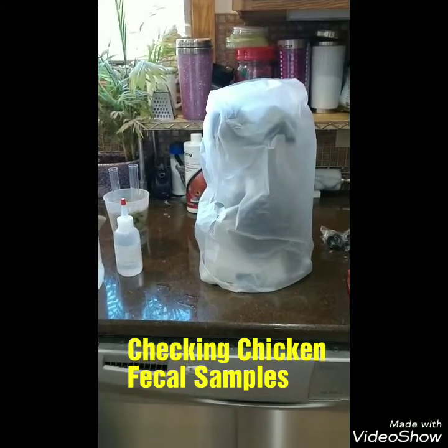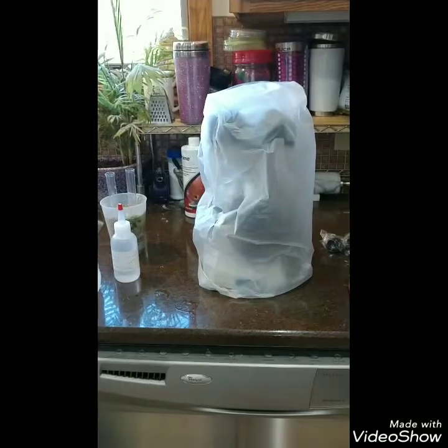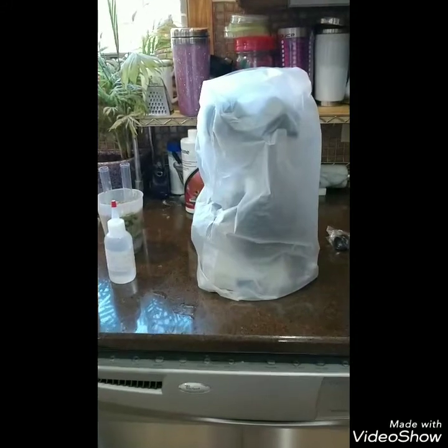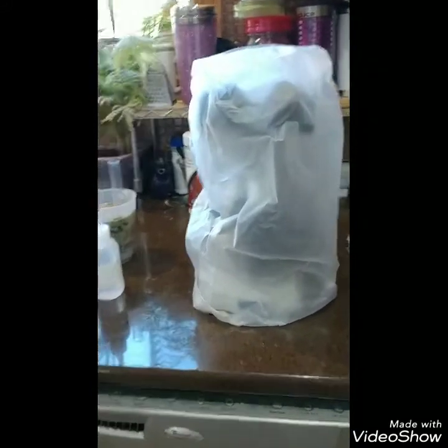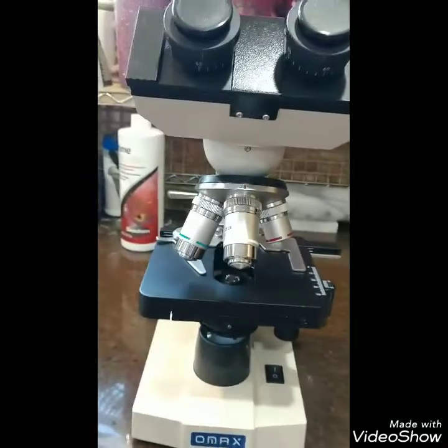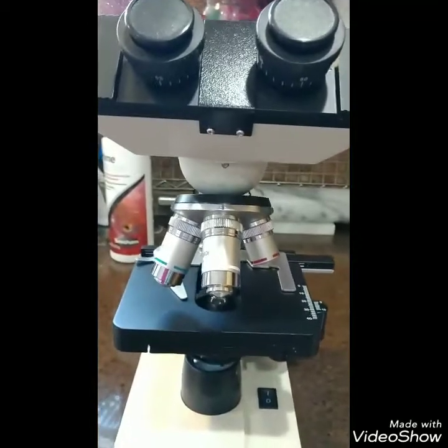Hey everybody, today I am going to talk a little bit about how I check my own chicken fecal samples. I have my microscope here with my cover on, and I actually keep my microscope in a backpack with a zipper on it because it's very important that you don't get a lot of dust in the lenses. So I'm just going to pull my cover off here and it's already plugged in.